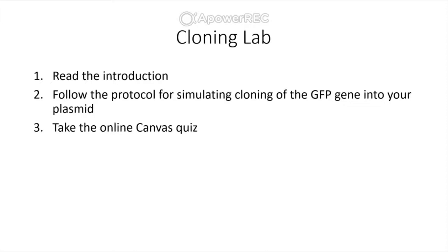So our cloning lab: after you finish watching this video, you're going to read the introduction, and following the introduction in the document, you'll find a protocol for simulating cloning of the GFP gene into your plasmid. You will need to use your GFP sequence that you previously made in the previous lab, so make sure you have that handy. If you're using a different computer, go ahead and send that to yourself and download it onto the computer you're currently using. After that's done, you can take the online Canvas quiz and you're all done.